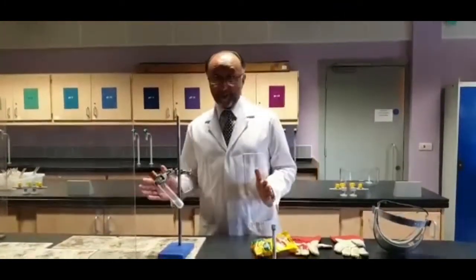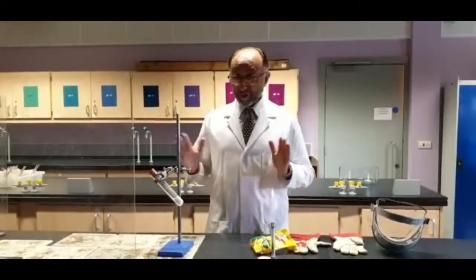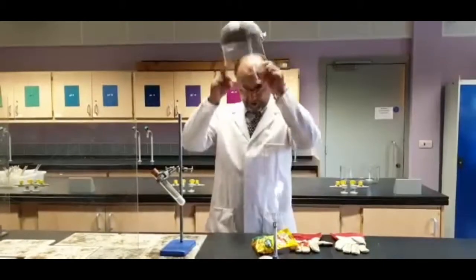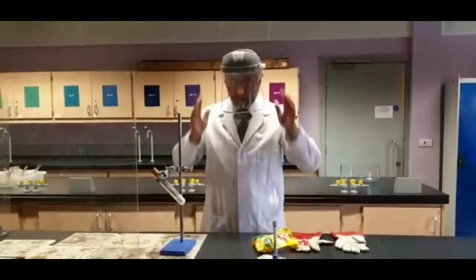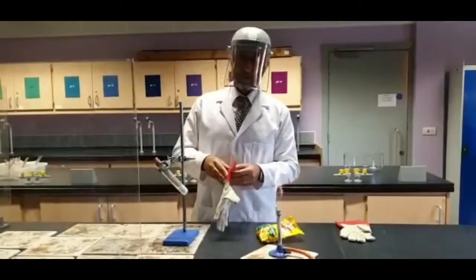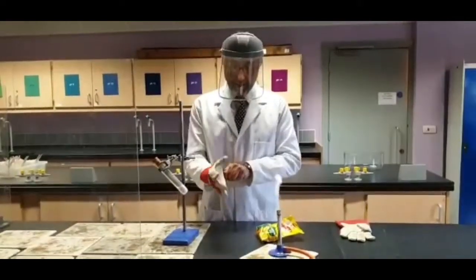Now, before I do the experiment, what I have to do is make sure that I am acting in a safe manner. So, first of all, I've got some protection. I could wear goggles, but I'm going to wear this face protection. And I'm also going to wear some gloves, in this case, to protect my hands.